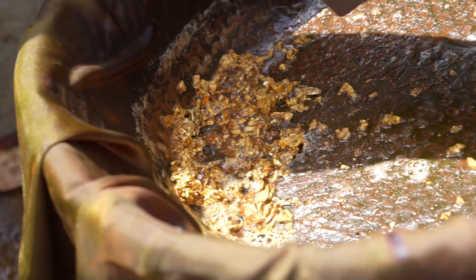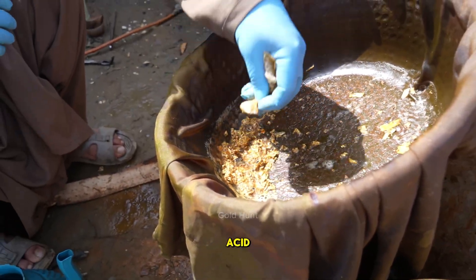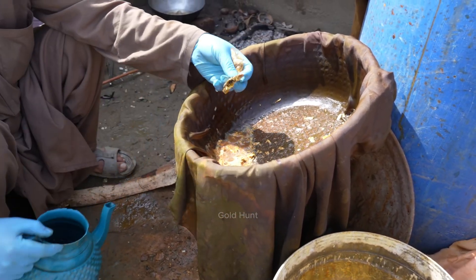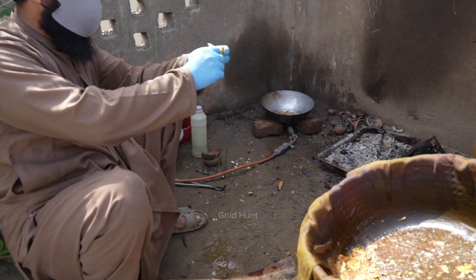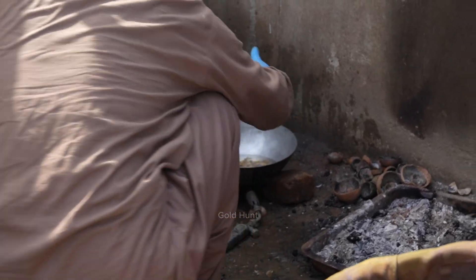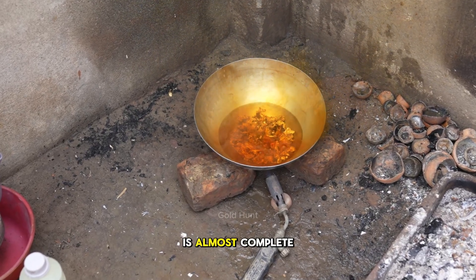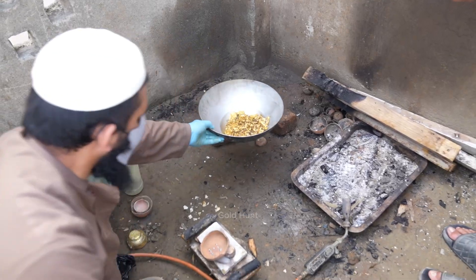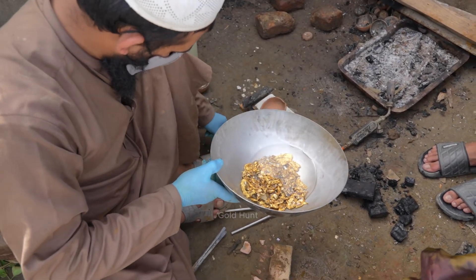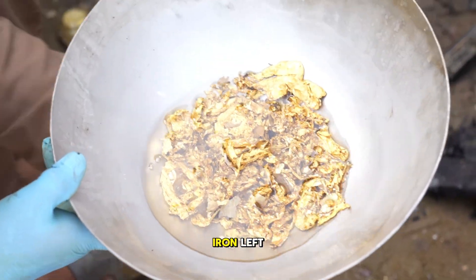Next, we'll use a magnet. If there's still any iron left, we'll remove it and put it back into the acid so that any remaining gold can be extracted from it. The nitric acid has started reacting again, and our process is almost complete. We'll pass the magnet through once more just to make sure there's no iron left.